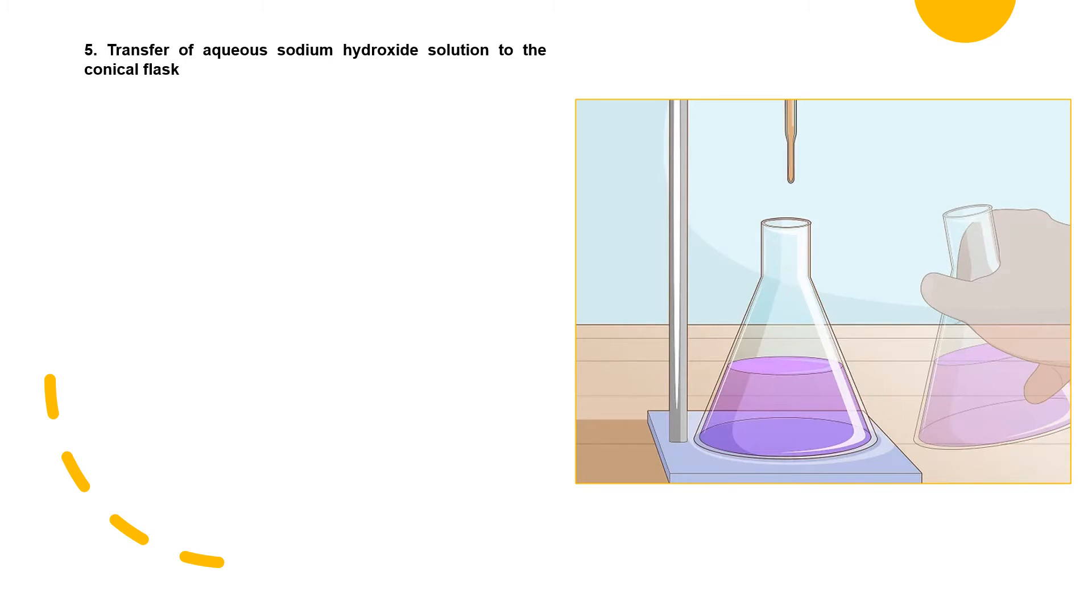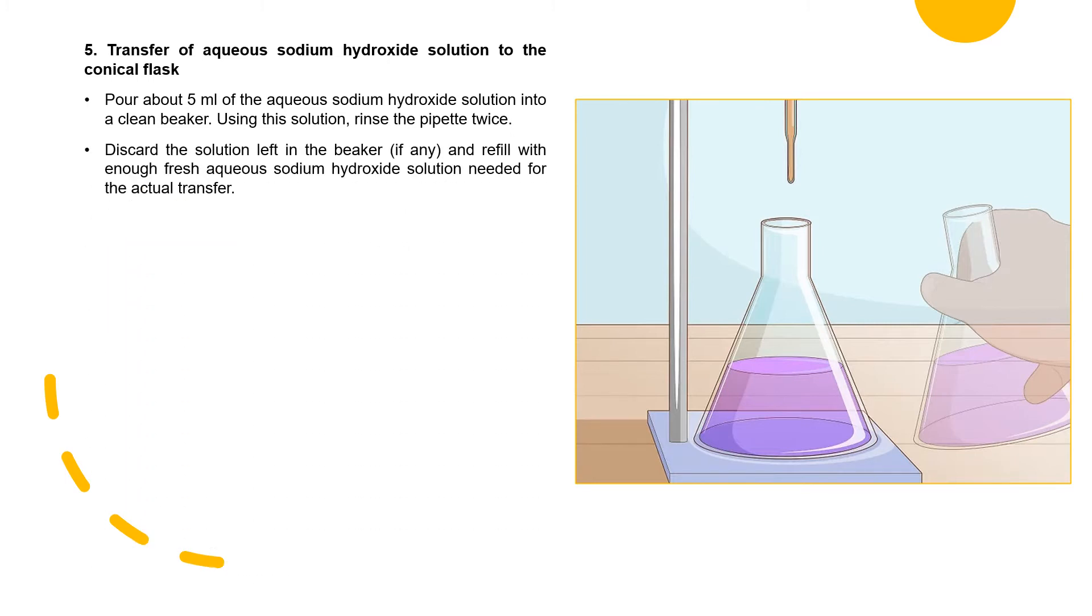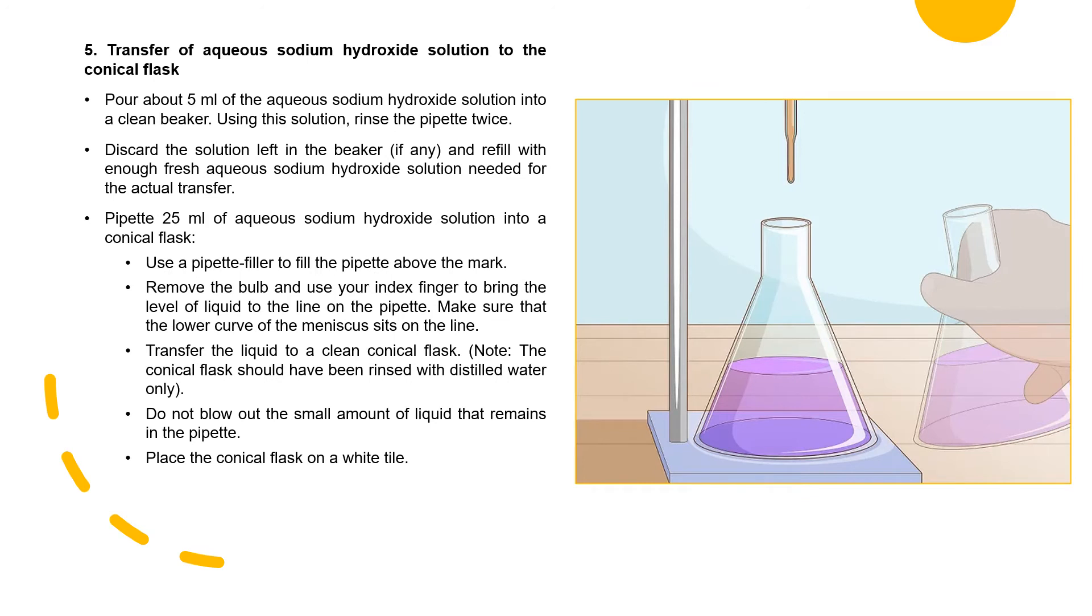Transferring of aqueous sodium hydroxide solution to the conical flask. Pour about 5 ml of aqueous sodium hydroxide solution into a clean beaker. Use this solution to rinse the pipette. Discard the solution left in the beaker and refill with enough fresh aqueous sodium hydroxide solution needed for actual transfer. Then pipette 25 ml of sodium hydroxide solution into a conical flask. Use a pipette filler to fill the pipette above the mark. Then you must remove the bulb and use your index finger to bring the level of the liquid to the line on the pipette. Transfer the liquid to the clean conical flask and make sure to not blow out the small amount of liquid that remains in the pipette. Place the conical flask on a white tile. Using a wash bottle with distilled water, flush down the droplets of aqueous sodium hydroxide solution remaining on the inside of the wall of the flask.